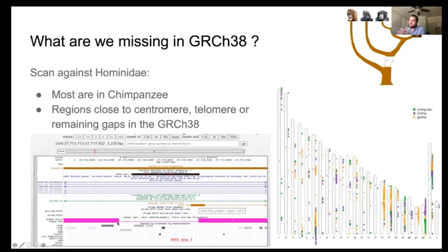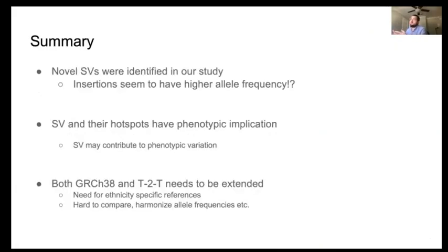So this means that the reference here is certainly biased and doesn't well represent the Han Chinese population, and that this contig should be used in this reference region itself to complete the reference, because this deletion is apparently not true in GRCh38, right?